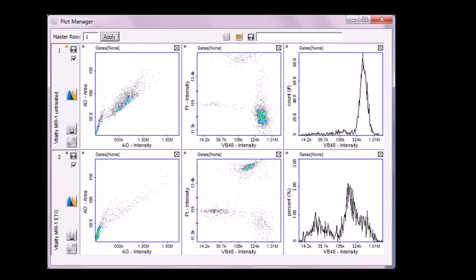After the analysis, we will get histograms of the sample: above the control and below the apoptotic sample. The control has a high general fluorescence intensity of the Vitabrite 48 staining, while the apoptotic cells have a subpopulation with a low level of reduced thiols and hence low staining with Vitabrite 48.